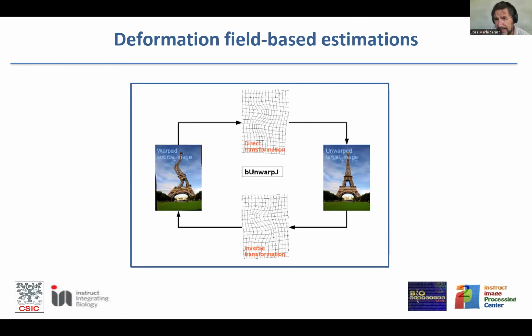I'm not interested in those cases where my methodology is not going to work. I'm interested in those cases in which the macromolecule has a defined composition. We are not talking about compositional heterogeneity. We are talking that the map is flexible, and I may work in atomic resolution. Most often, I will not be working in atomic resolution.